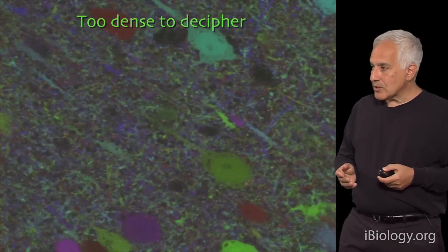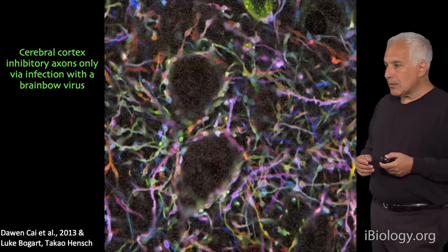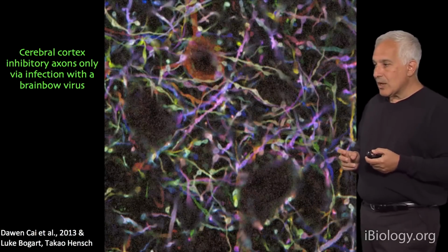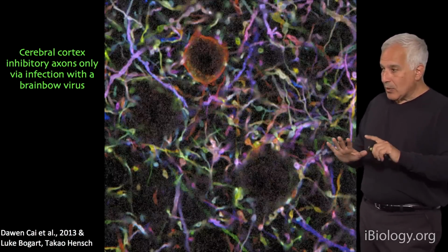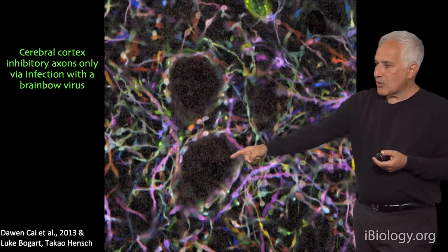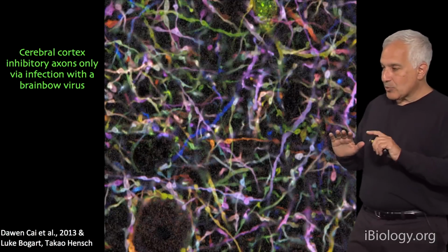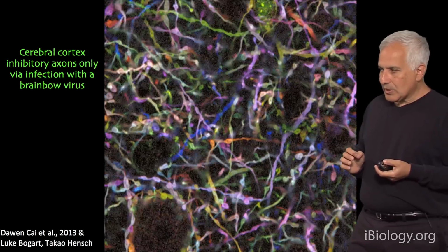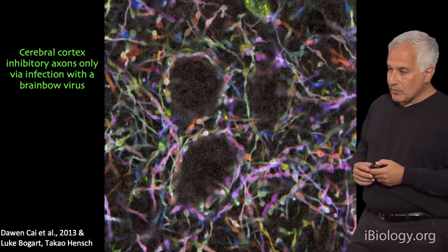I'll just show you one example of this, which is a piece of cortex in which the virus was used to infect cells that also have parvalbumin-driven Cre. And PV, parvalbumin, is found in inhibitory neurons. And what you're seeing in this nest of axons are axons that surround the cell bodies, these dark objects like that, that are pyramidal neurons. And those pyramidal neurons are encrusted with inhibitory axons. And we think techniques like this will allow us to trace out, for example, inhibitory networks. You can see how much less dense this image is than the previous one.